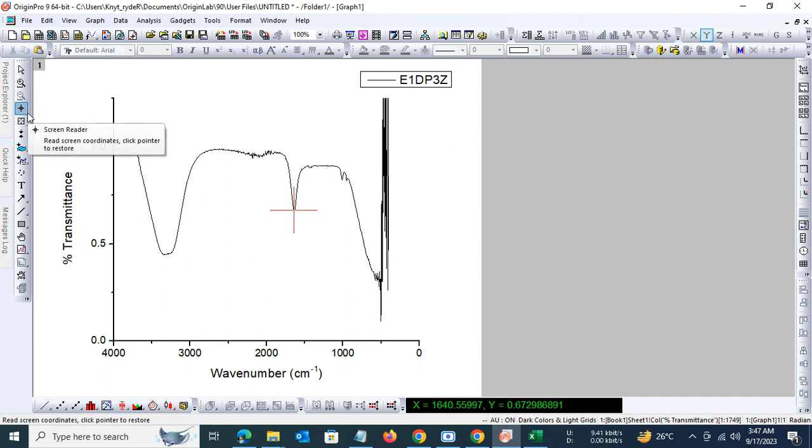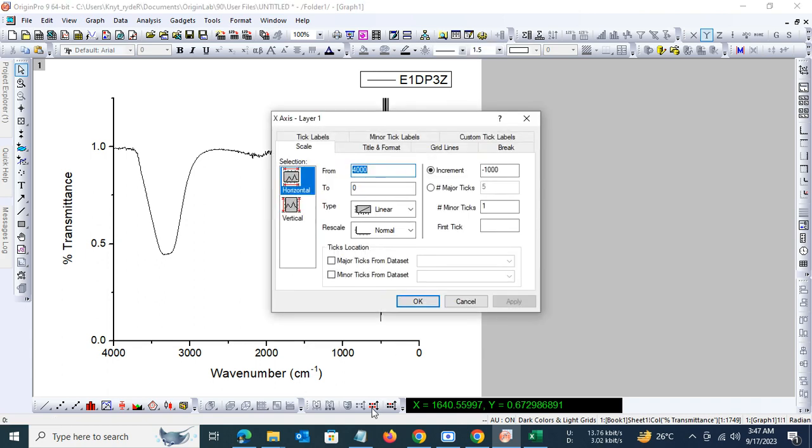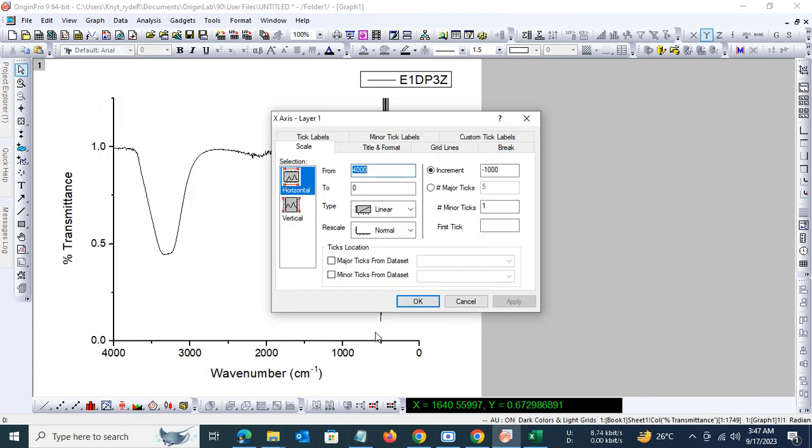To be sure about the kind of groups that are present in the compound, let us refine it further. If you look at the data point, the last data point is 399.219. So in the axis settings here, let us type in 400.